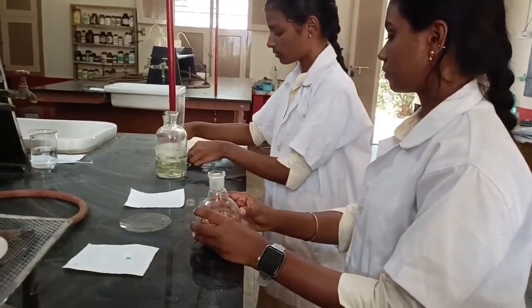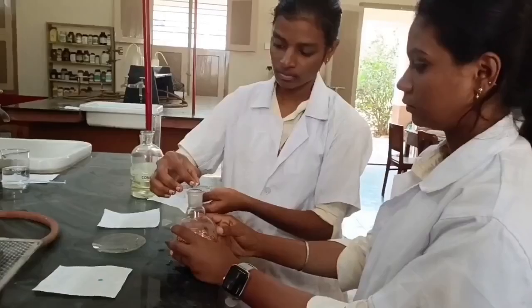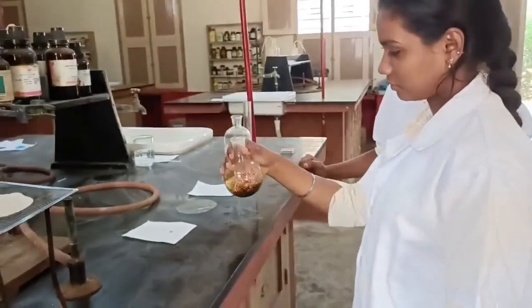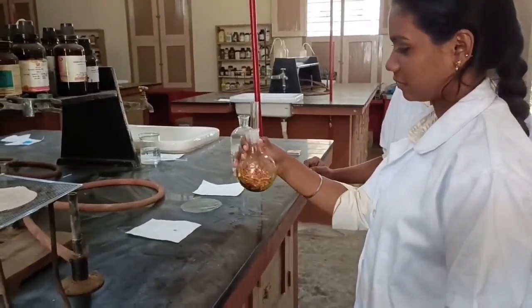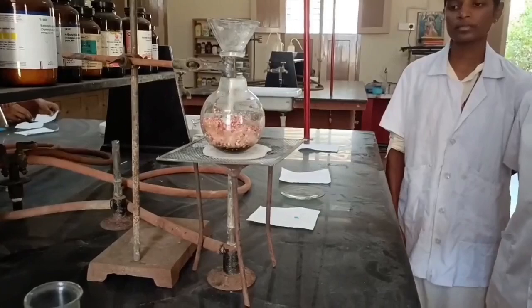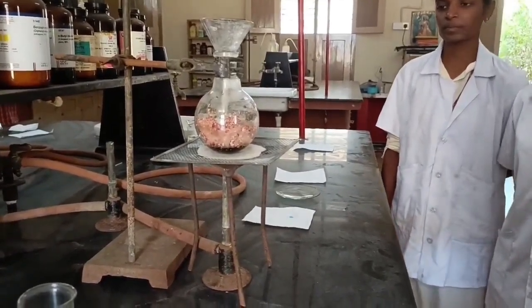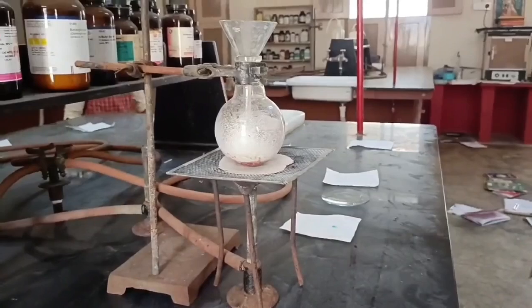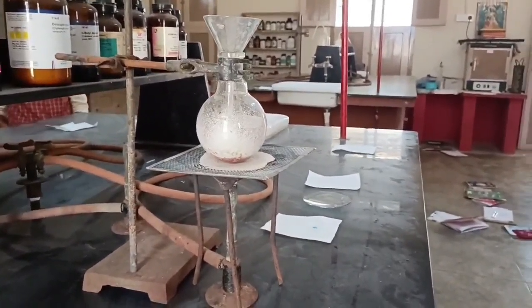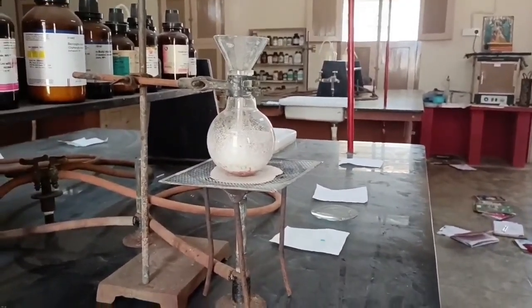Next we are adding a porcelain piece into the reaction mixture. This porcelain piece helps for smooth boiling and stops the bumping. Then we are mixing all contents properly and heating them on a Bunsen burner by keeping a wire gauze. You must see it changes its color to straw yellow color — beginning it is bluish green, then it changes to straw yellow. After that you can stop boiling.